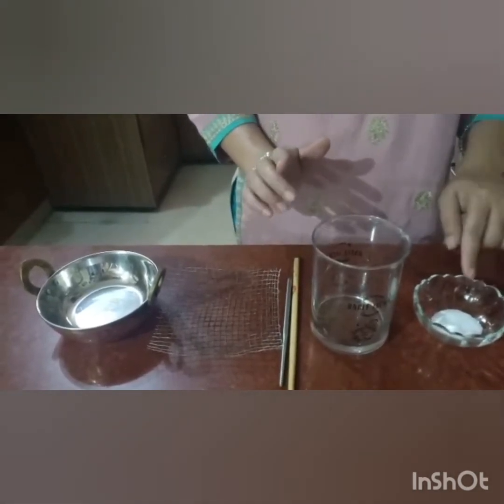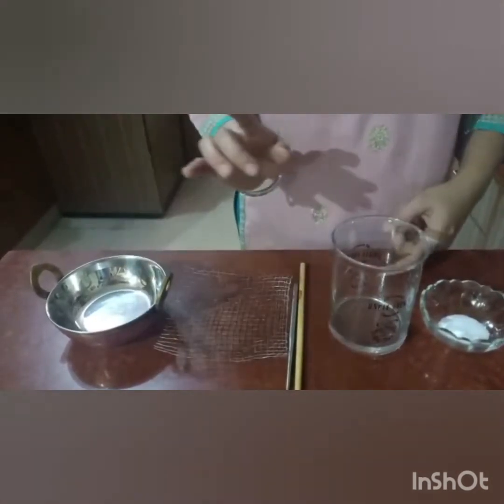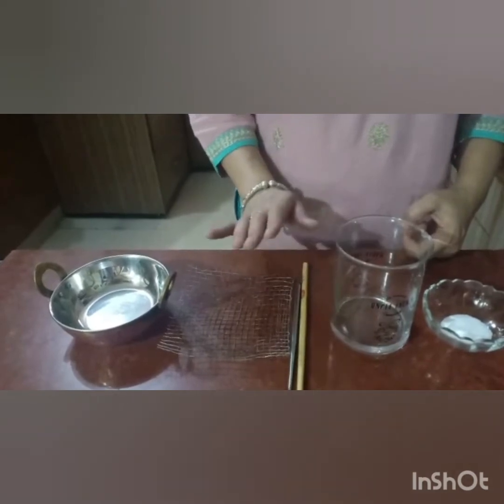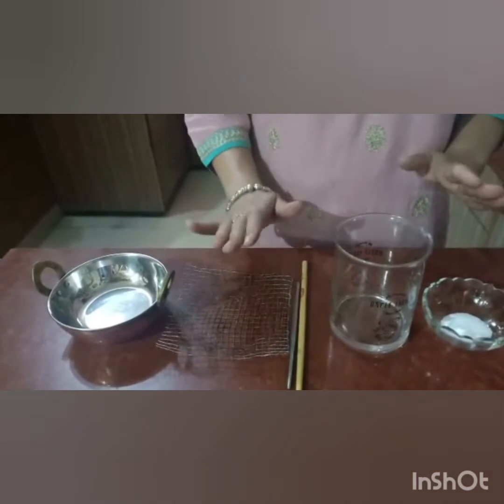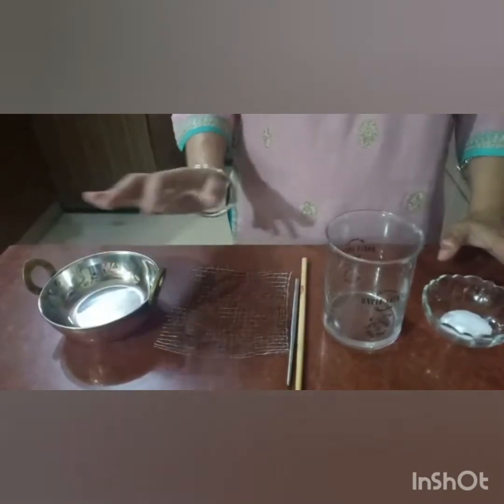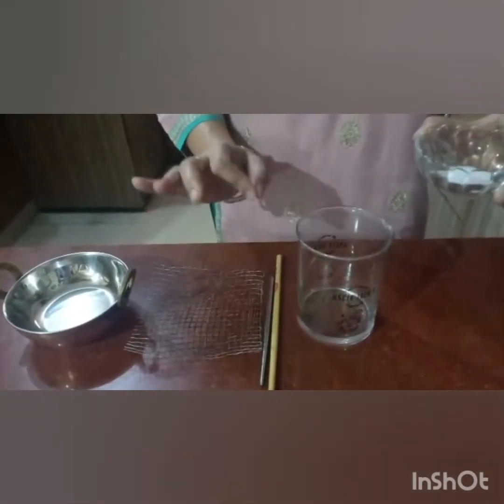I need salt, water, then wire gauze, evaporating dish and a burner, then matchbox, glass rod to stir, and then we'll heat. So I have these kind of things to perform my experiment. Now comes the procedure. How do I proceed with the experiment? How do I perform the experiment? The first thing that I have to do is prepare the salt solution.